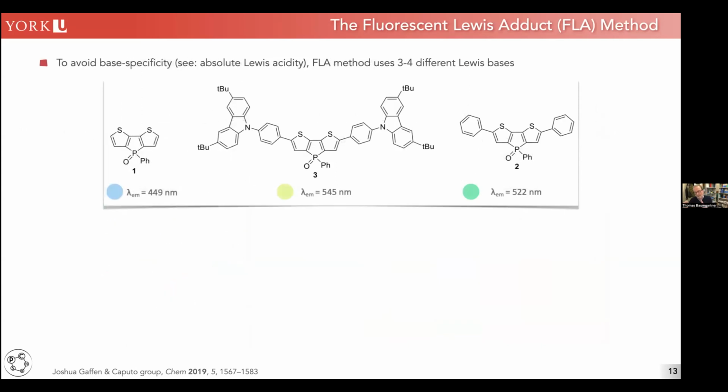But to move away from that trapdoor that is the absolute Lewis acidity, we actually do these measurements with at least 3 Lewis bases. Ideally, we do it with 4, because at the end of the day, the point that we measure could easily be one of those absolute Lewis acidities, and I'll show you ultimately it is, because they do change. So we actually change the Lewis basicity of our species to some extent, because each of those species has a different pi star system that has a different interaction with the sigma star of the phosphorus oxygen bond here. So we do modify the Lewis base strength by adding at least 3 Lewis bases into the mix. And what happens is this.